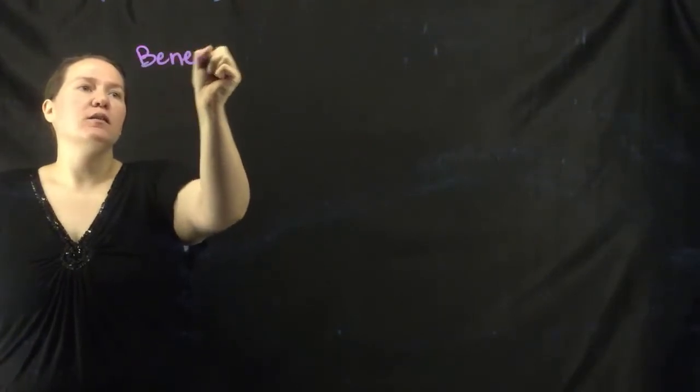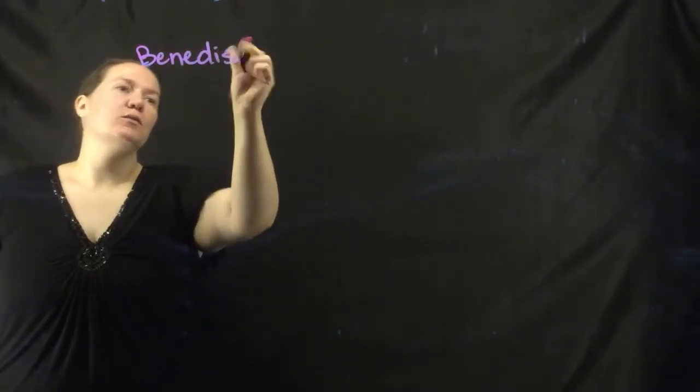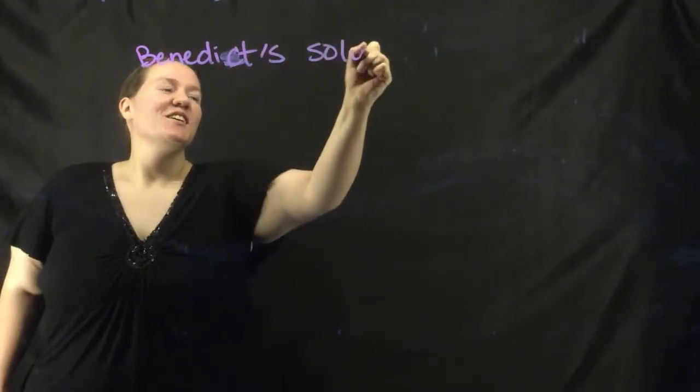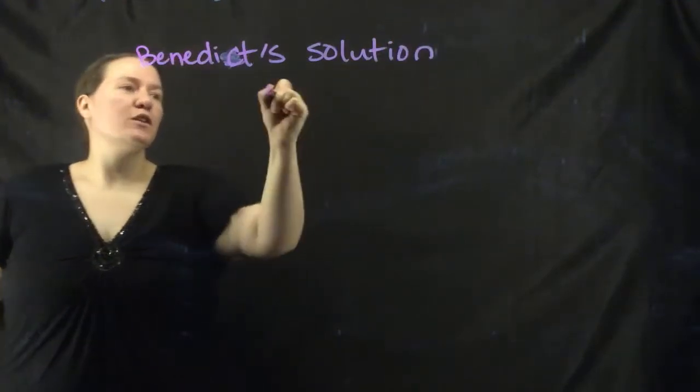Okay, so we're back again. We had our Benedict solution that tested for simple sugars. Okay, so that was our simple sugar.